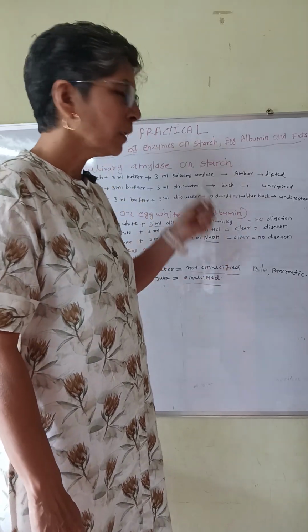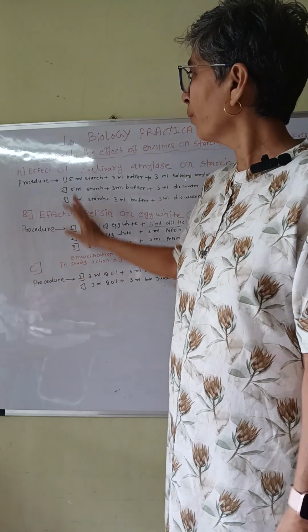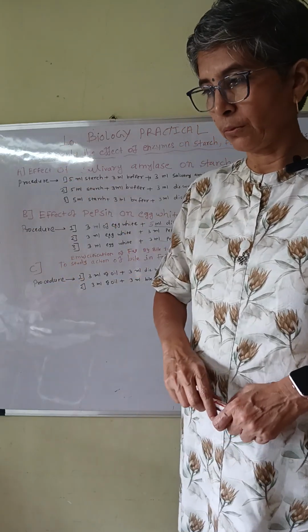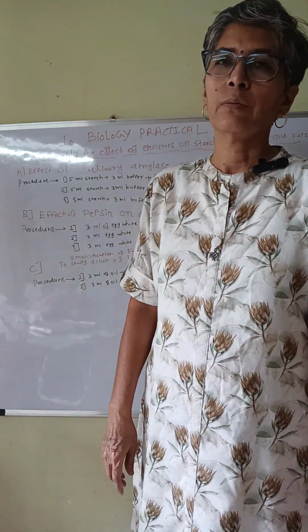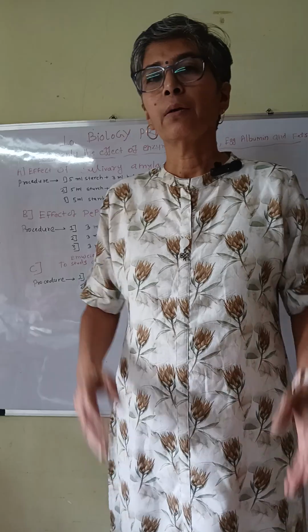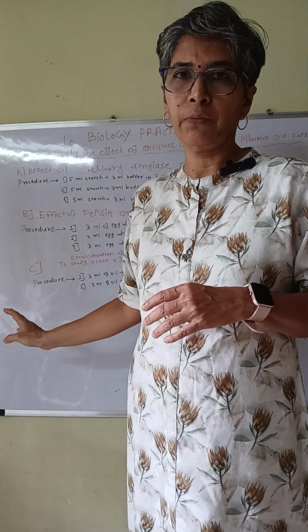Okay, this is the whole practical of practical number 10, 11 biology. Okay, so you have to write the observation table, color changes and conclusion in these 3 different activities.